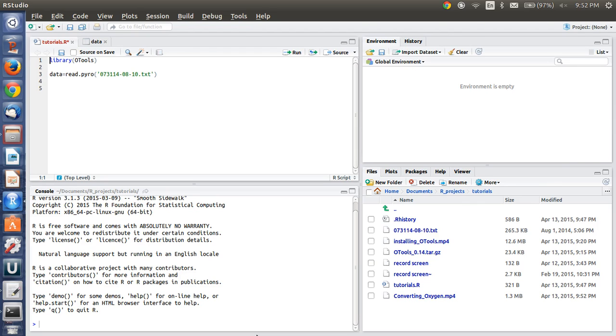I hope also to have in the near future functions in here to convert from kilopascals or hectopascals, so from pressure units as well, and then probably from milligrams oxygen per liter as well. But for the moment we just have micromoles oxygen and O2 saturation tools, because those are the ones that we use most in the lab.